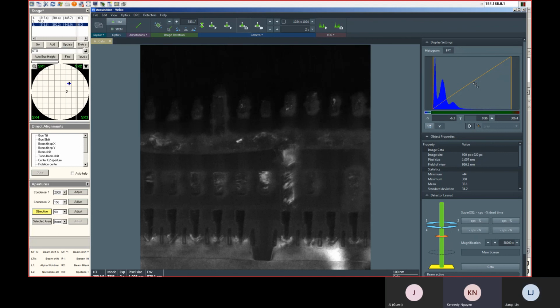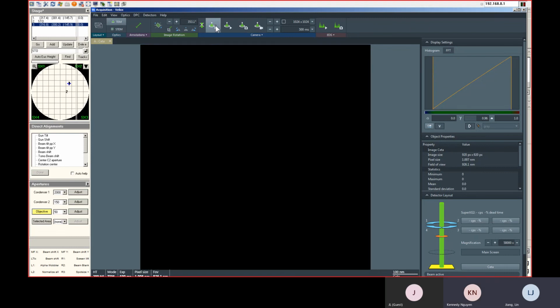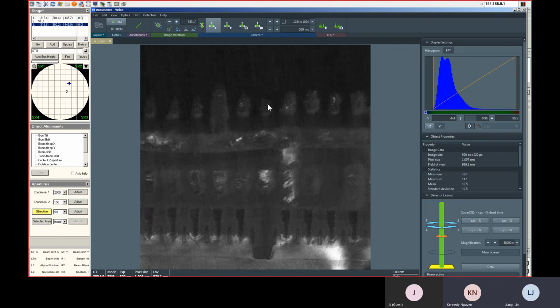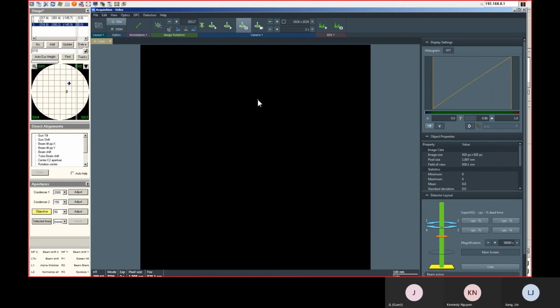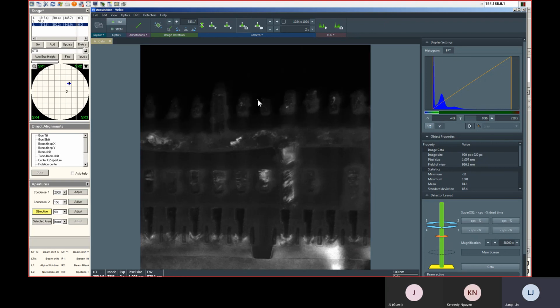What do you mean by an intensity knob? The intensity knob on the hand panel. Okay. Condense the beam a little bit, right? You take a look at yours. I can go increase the intensity. Okay. Let's take another image. Perfect. Yeah, that's your dark field image. All right. Cool.